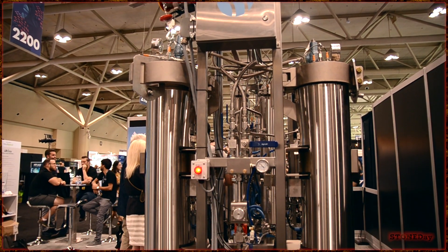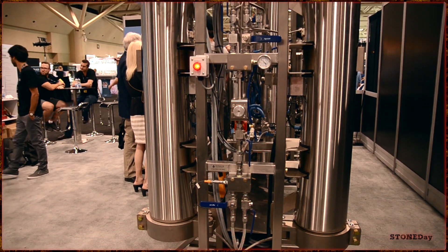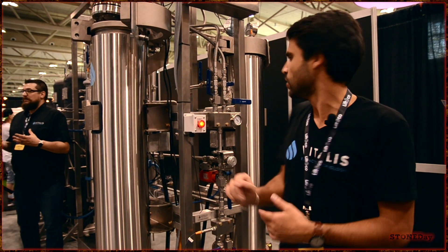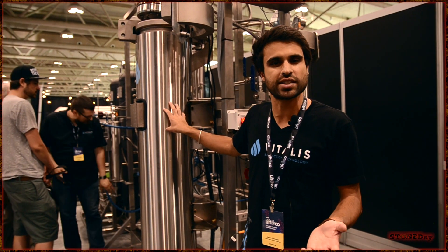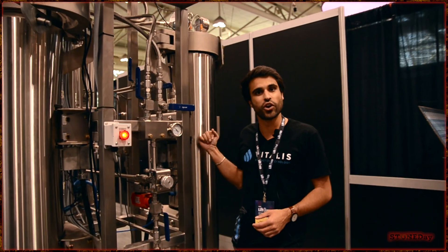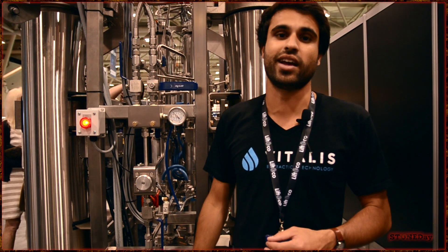We also have two sides to this — the A side and the B side — so you can have continuous operation. This 45-liter vessel plus the other 45-liter vessel will be your A side. While your A side is extracting and doing its thing, you're preparing your B side: loading it with your material, cleaning it if it needs to be cleaned. This will take about a four-hour to eight-hour run time. Once that's done, turn the valve and all of a sudden you're extracting on the other side. So you're going 24 hours a day — it never stops. Once you're on your B side, you can start cleaning up your A side and refresh it for the next time. You can run for 24 hours a day.